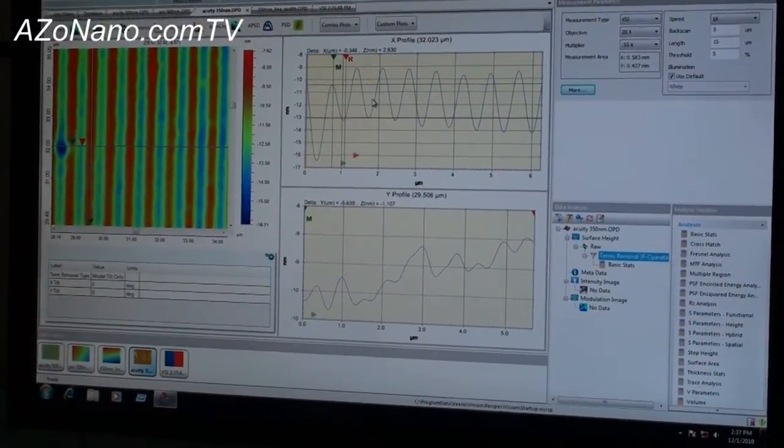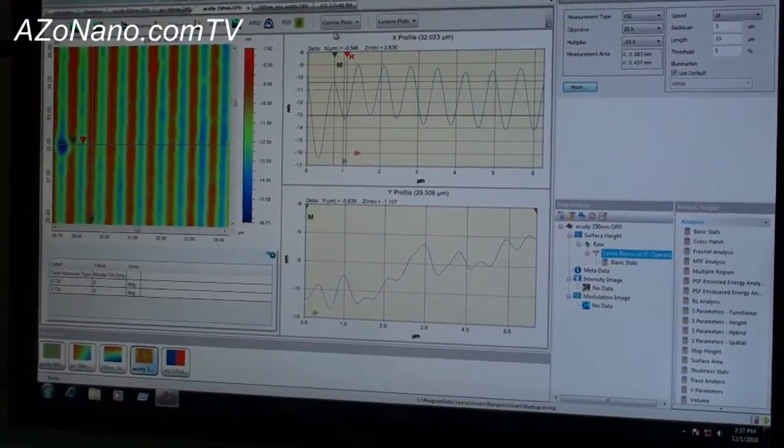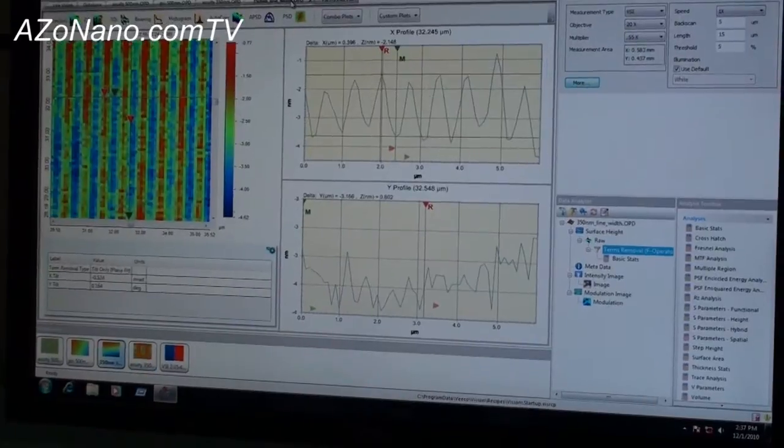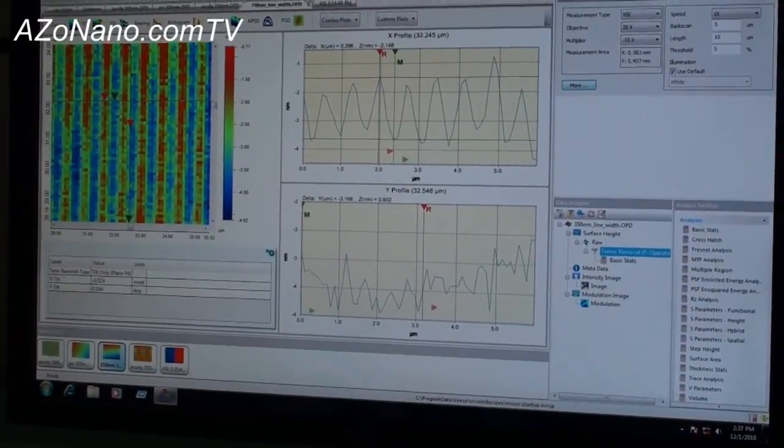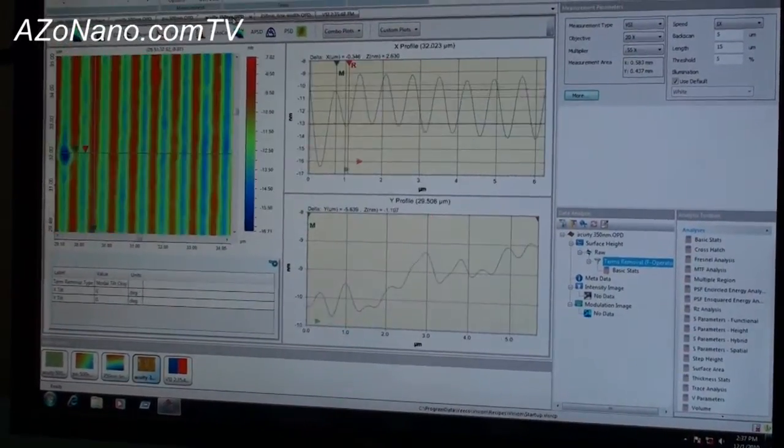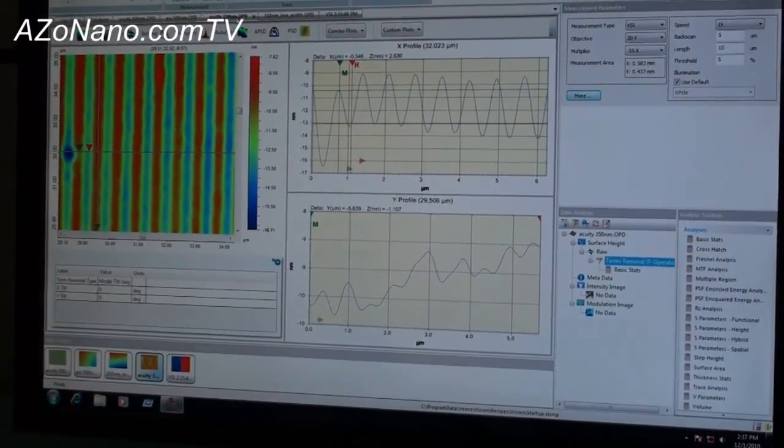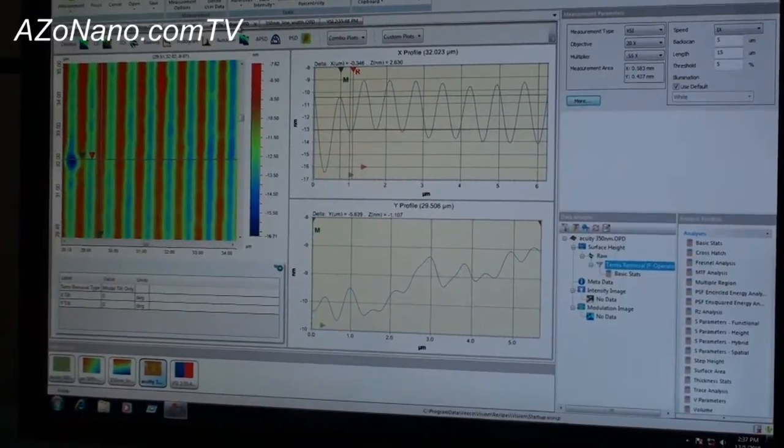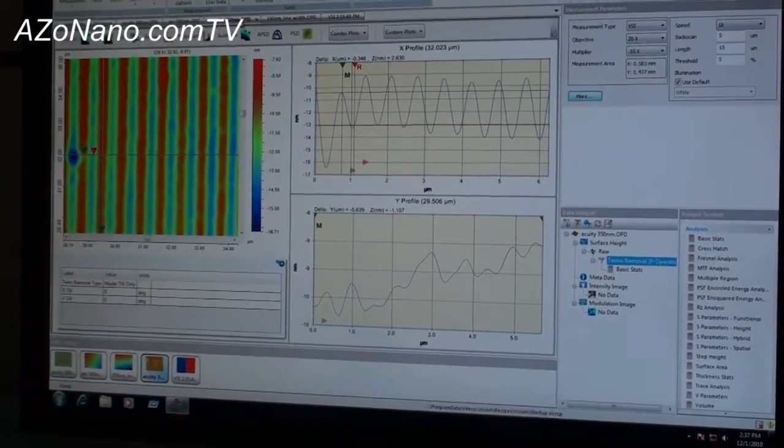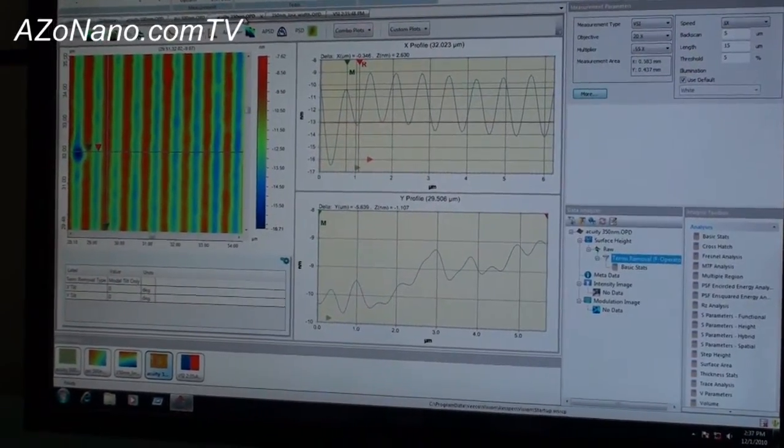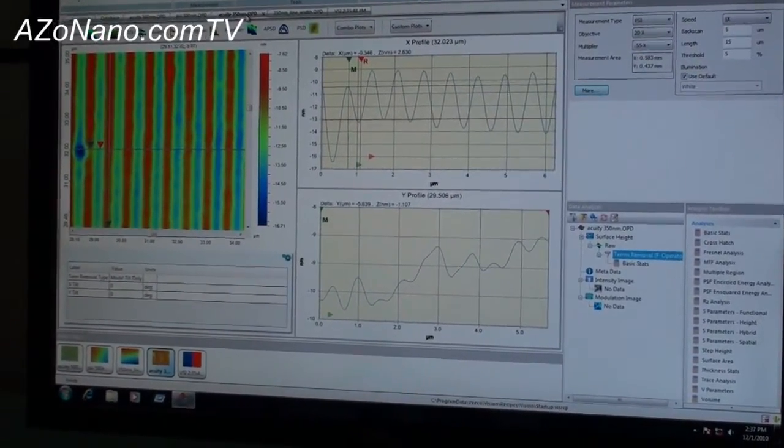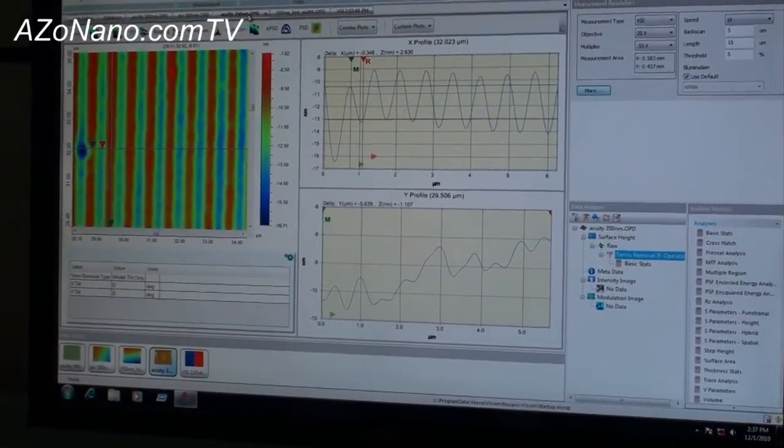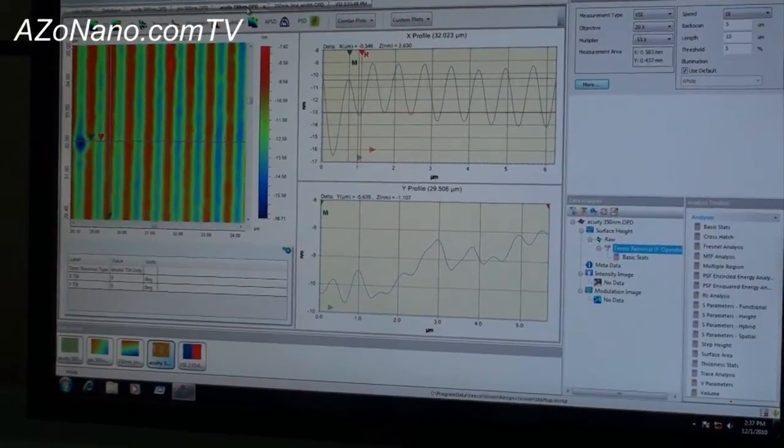As you can see, this is without the acuity XR and this is with the acuity XR. We get much better lateral resolution but it also gives us much better lateral gauge performance so we can get much more repeatable data out of this system.